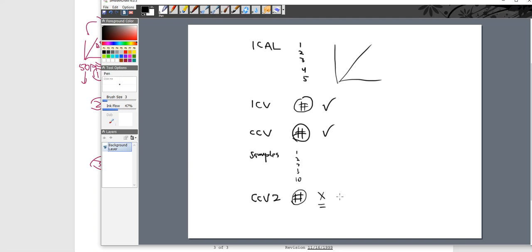What this table tells us, and the thing of quality control, is that, all right, you cleared it out in the beginning, but folks, something happened here as the samples were running. You were running 10 samples, and throughout this time, something was questionable, and something became a little different, because here it did not pass. And what this means is that when we look at the CCV for 1, and when we look at the CCV for 2, I can't report any of that data.